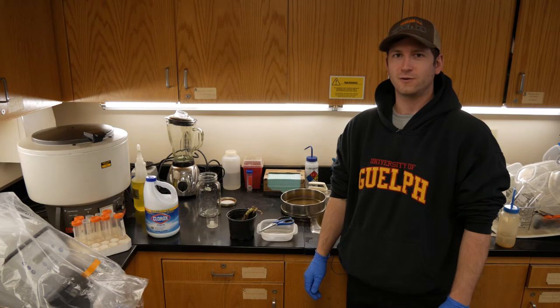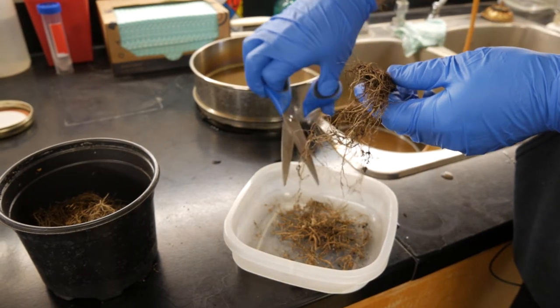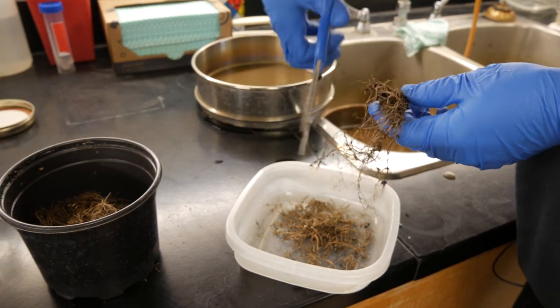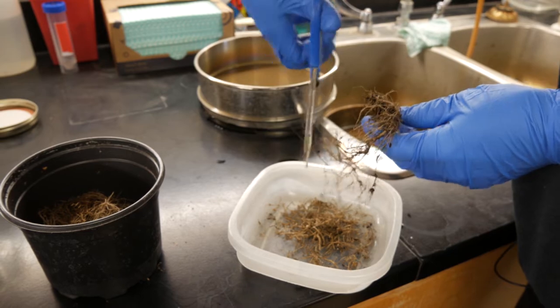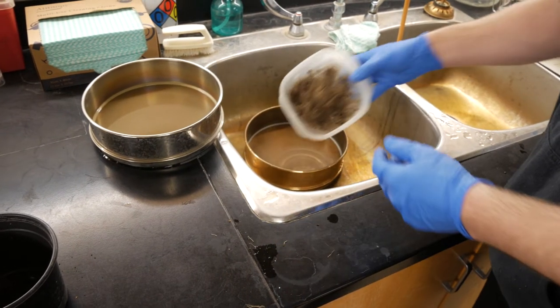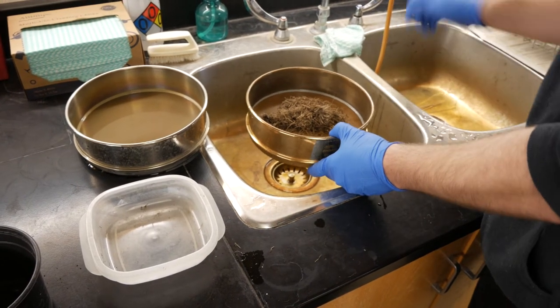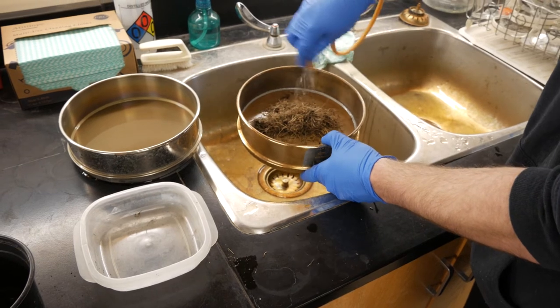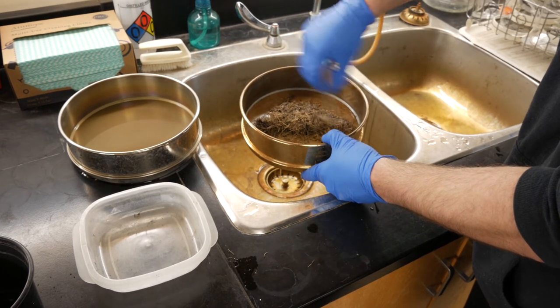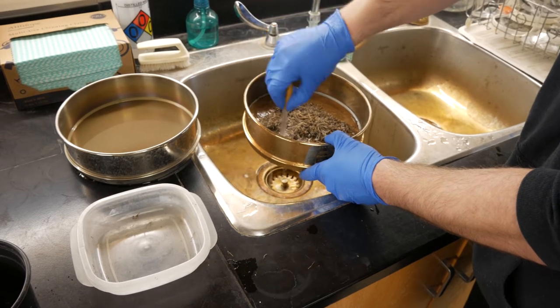We're here in the lab now and the first thing we want to do is cut the roots into smaller pieces — one to two centimeter long pieces — and collect them in some kind of container. Now that we have our cut sections of roots, we want to wash them a little bit just to get some of the dirt off. We put them into a 200 sieve and use low-pressure fanned water to get them a little bit cleaner.